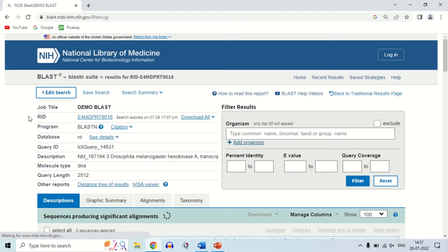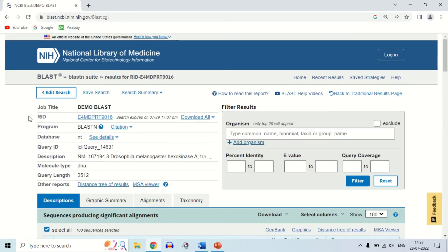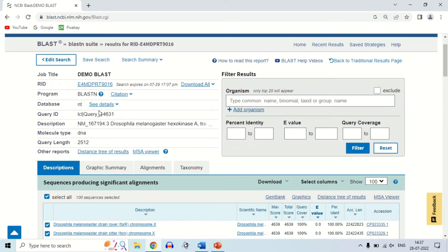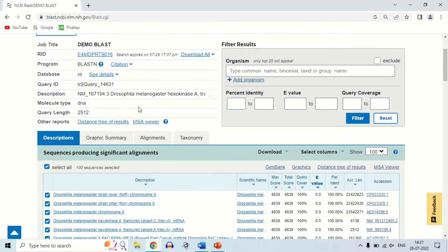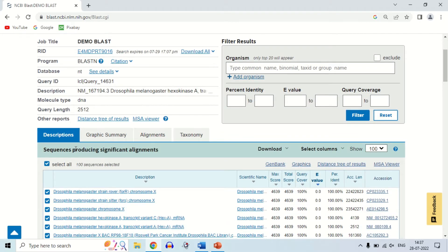The results are now in front of us. The BLAST results are divided into four sections: descriptions, graphic summary, alignment, and text only. Let's discuss them one by one.